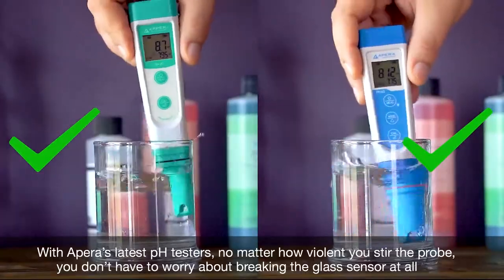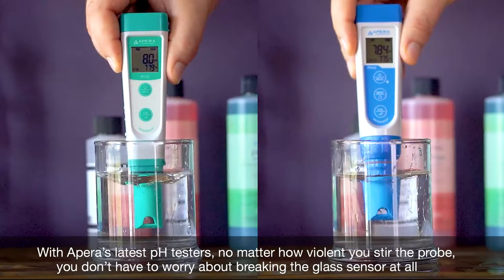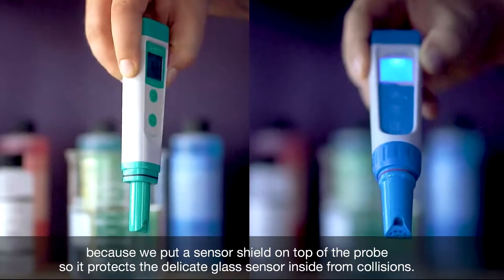With Apera's latest pH testers, no matter how violently you stir the probe, you don't have to worry about breaking the glass sensor at all, because we put a sensor shield on top of the probe so it would protect the delicate glass sensor inside from collisions.